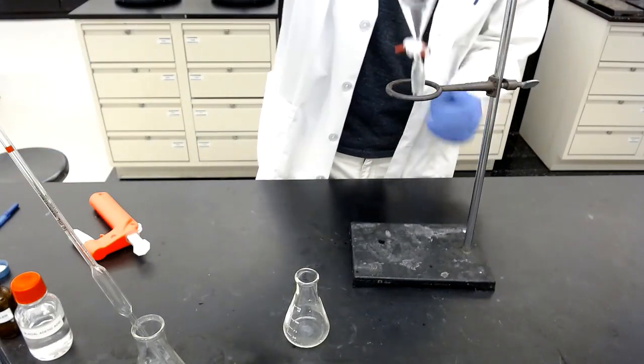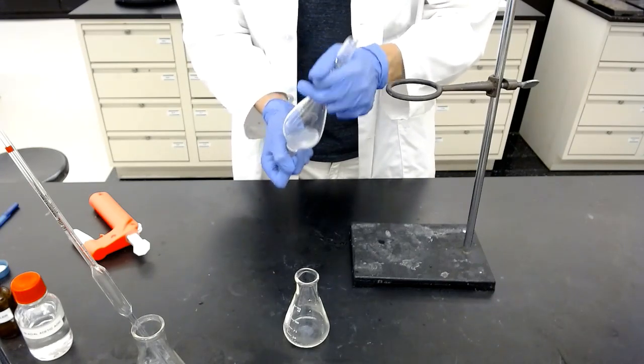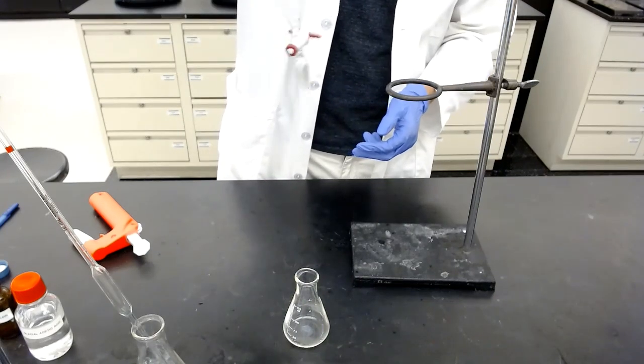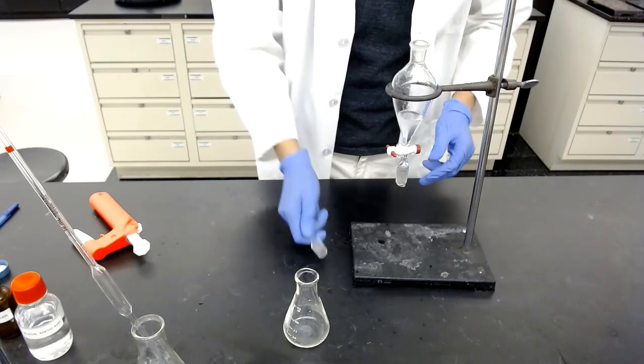Cap it. Flip it over. Vent. Shake. Vent. Shake. Vent. Shake. And vent. Close it. Alright, let it settle down for 2 layers. Always take the stoppers away.